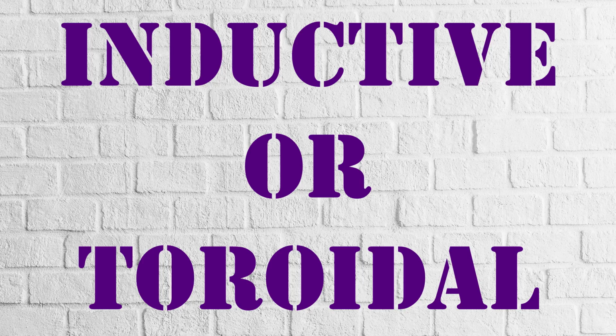Measurement electrodes can be in contact with the solution, or inductive or toroidal, without direct contact with the solution. The toroidal sensor consists of two sealed parallel coils within an insulated probe. A coil is excited with AC, which induces a weak AC in the solution, which depends on its conductivity. In turn, this current induces a measurement signal in the other coil, which is the one that indicates the conductivity of the solution. In fact, the liquid acts as the core of a transformer.